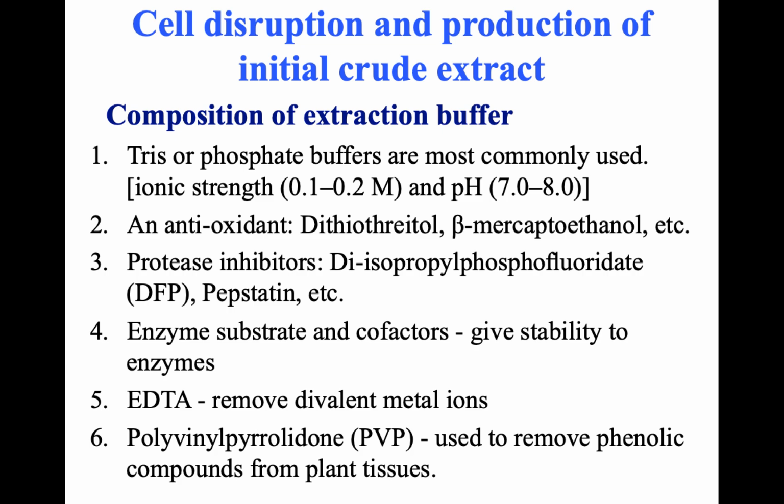In addition, we can also use EDTA, which removes the divalent metal ions from the samples. These divalent metal ions react with the sulfhydryl groups in the proteins and form mercaptides. To avoid this, we use EDTA, which removes the divalent metal ions.